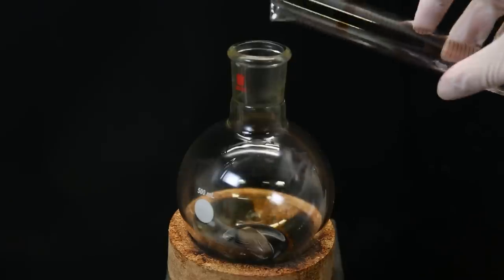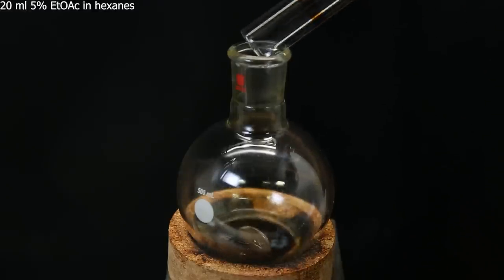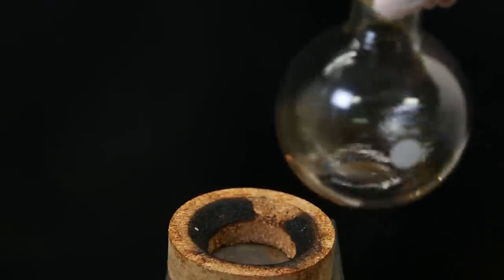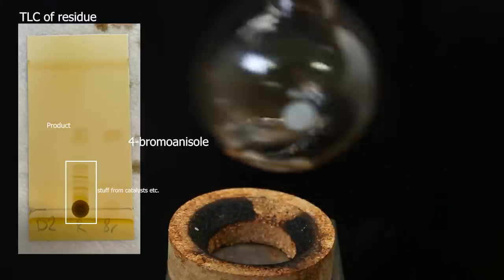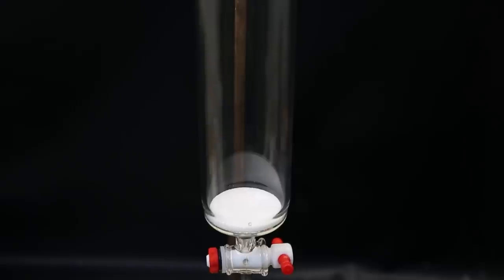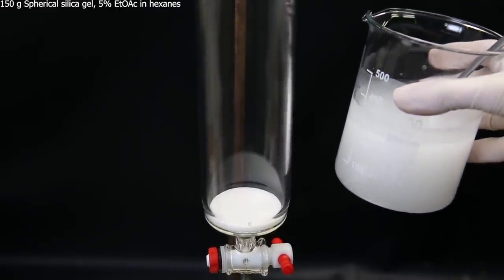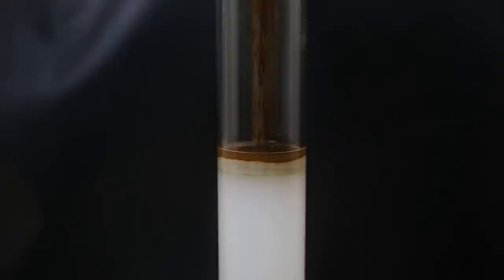Now to get the product, I have to do column chromatography, so I add some 5% ethyl acetate in hexanes to dissolve it. The polar components in the residue don't dissolve very well in this solvent mixture, but the product will, so it forms two layers. I then set up a column and add in 150 grams of spherical silica gel that I mixed with the solvent. I put a layer of sand on top and let the solvent level lower into the sand. I then use a pipette to put all of the product mixture on top. I let the product mixture lower into the sand, and then put a bunch more solvent on top.